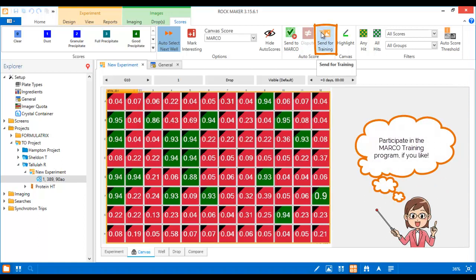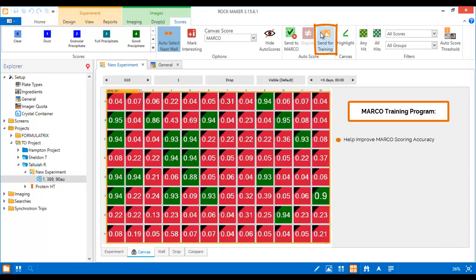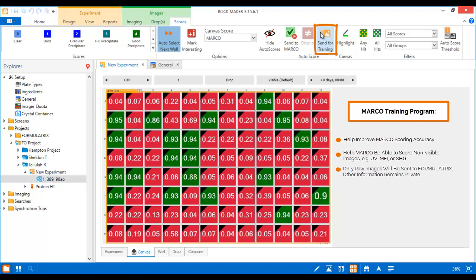You can also participate in improving the Marco scoring algorithm if you like. This improvement program aims at increasing Marco scoring accuracy and making it more versatile, so that in the future Marco can score images taken with different light paths. Don't worry, Formulatrix will only collect the raw images of your experiments if you opt into the Marco training. All of your plate information, such as well conditions and protein, will not be collected.